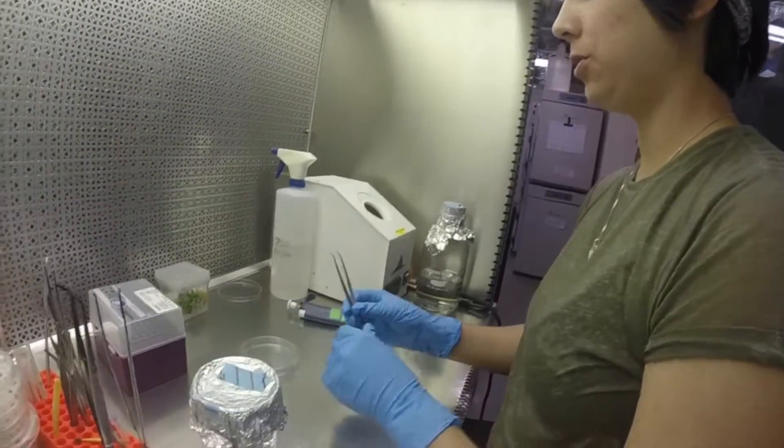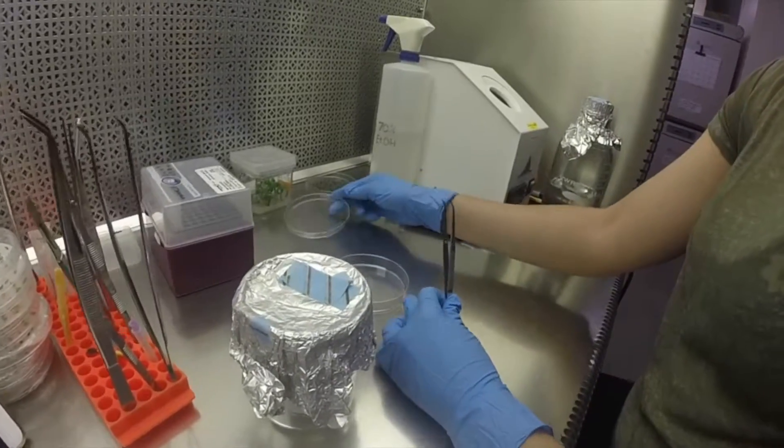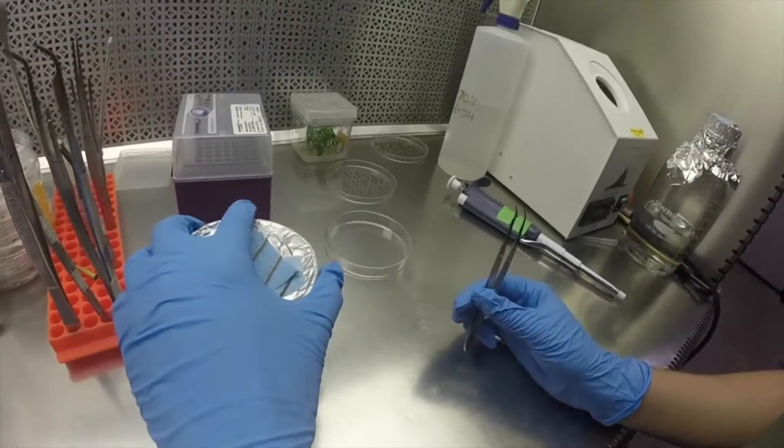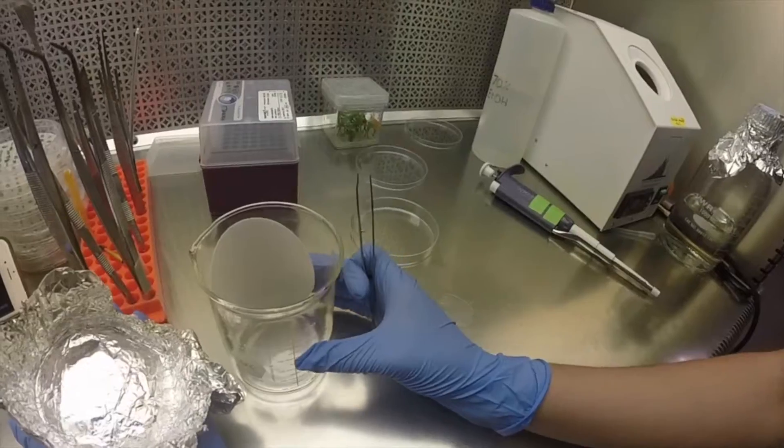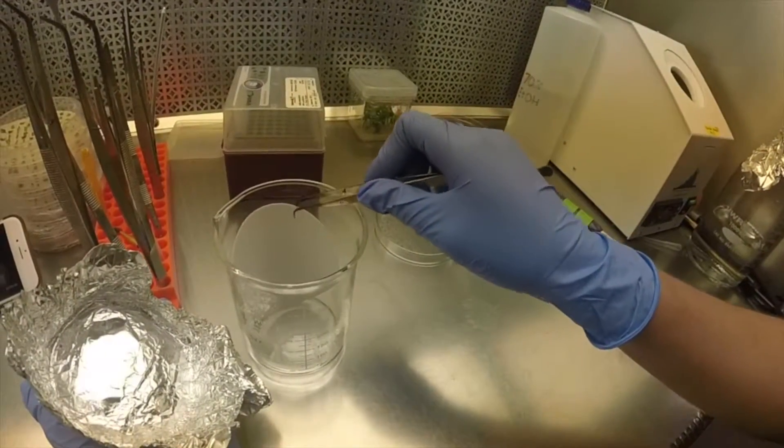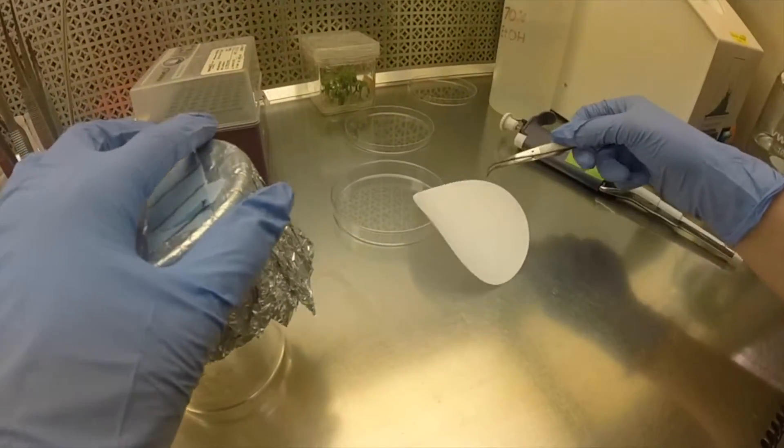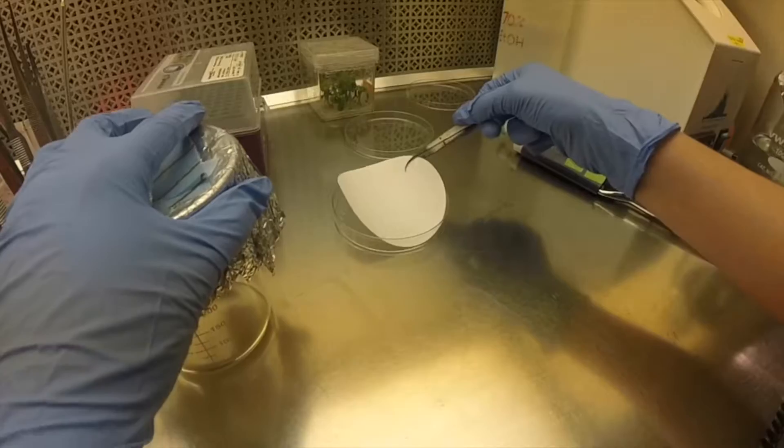What we're going to do first is make the culture that we're going to put the tomatoes on. We're using sterile filter paper. As you can see, these have been autoclaved. We're going to take one out and place it in the petri dish so it doesn't fall over.